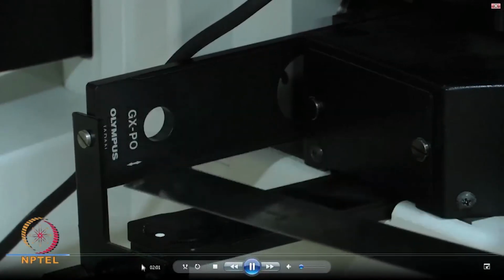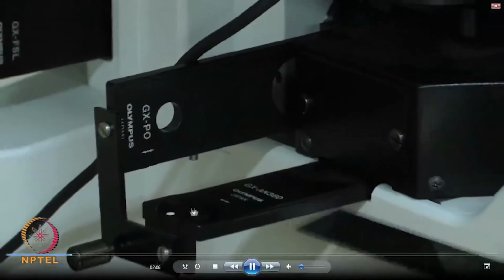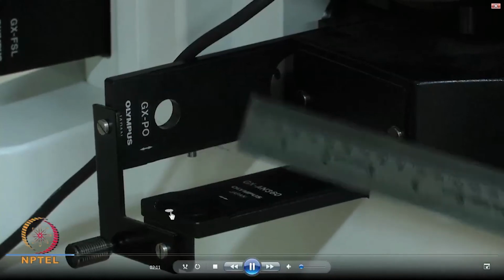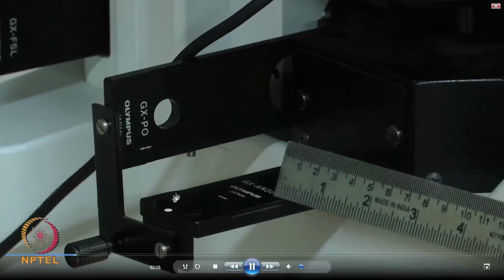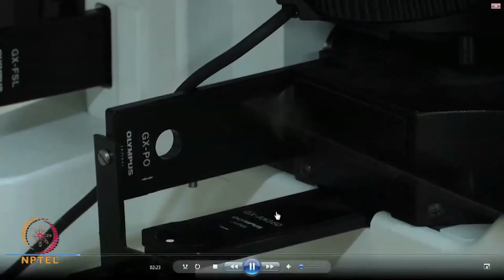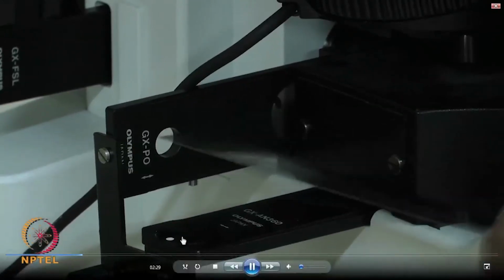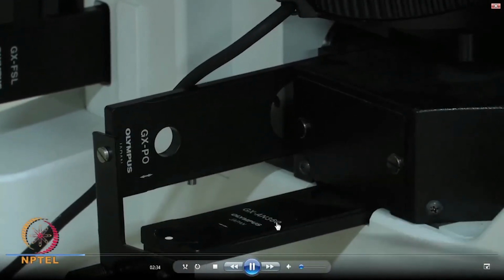And you can also see that there is a rotating knob here which is identified by this white spot. You can move this in a circle, that is, you can rotate these two to change the orientation of this analyzer. So, whatever we have seen in the slides, the geometry is exactly kept here.